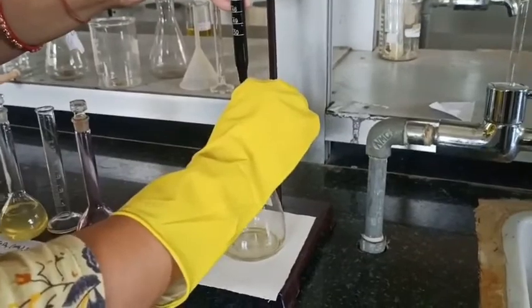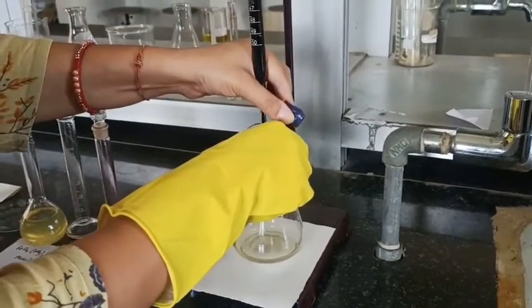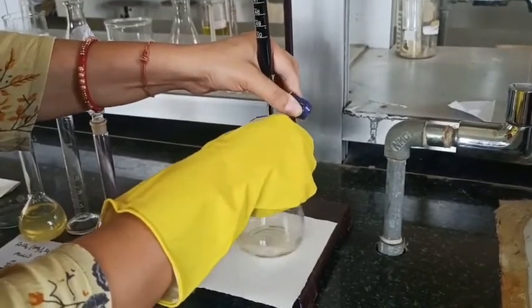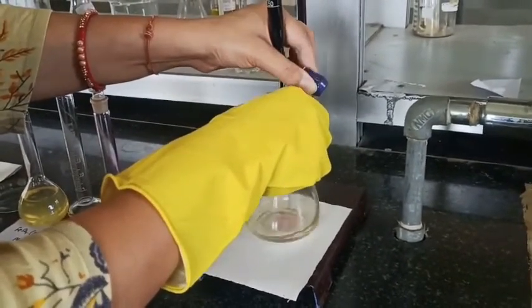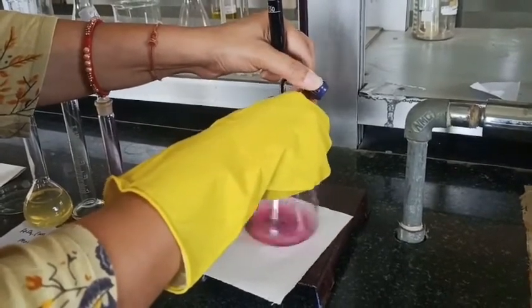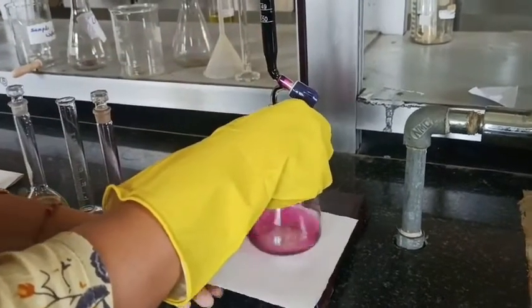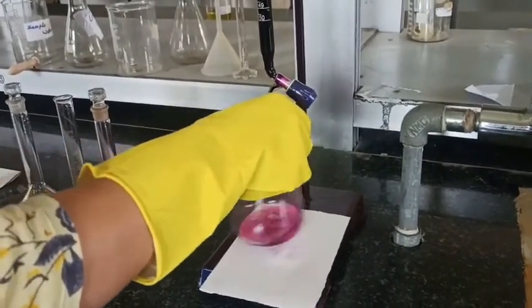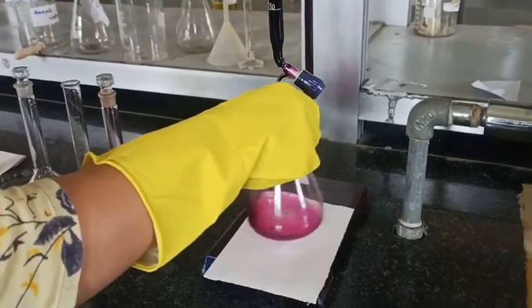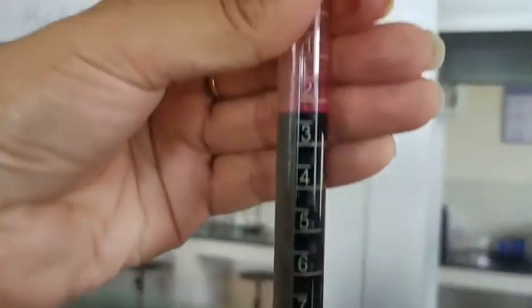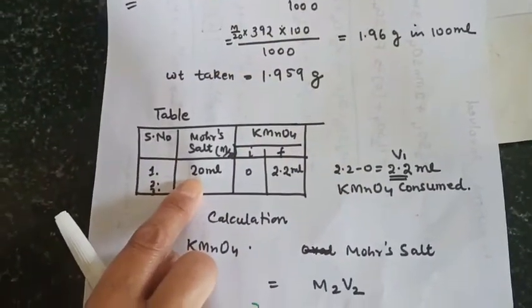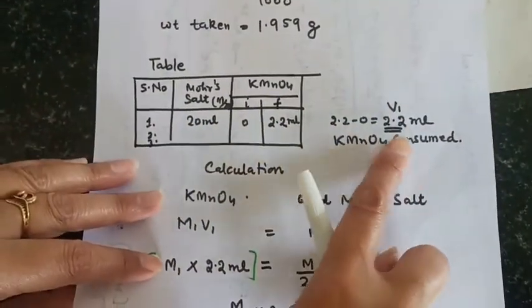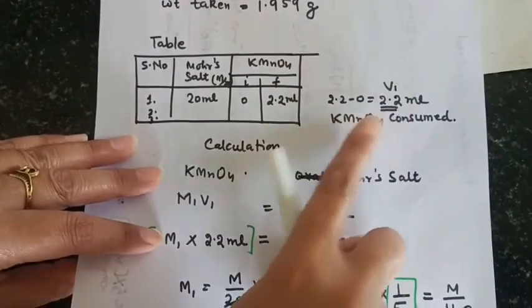Just to facilitate the redox reaction. You may also have a question why we previously added few drops of H2SO4 to the solution. That is just to prevent the hydrolysis of ferrous ammonium sulphate. And this is just to facilitate the redox reaction. Here is the initial reading of the buret before starting the titration. Here you can see the disappearance of KMnO4 color. It means iron 2+ is present there which is oxidized to Fe3+, and MnO4 ions are converted to Mn2+. Now all Fe2+ is converted to Fe3+, and no change in the MnO4 minus ion oxidation state. So we are having at the end point this purple color. Now we are measuring the final reading. It is 2.2. So here 20 ml of Mohr's salt I have taken, initial reading 0, final reading 2.2. So KMnO4 volume consumed is 2.2 ml.